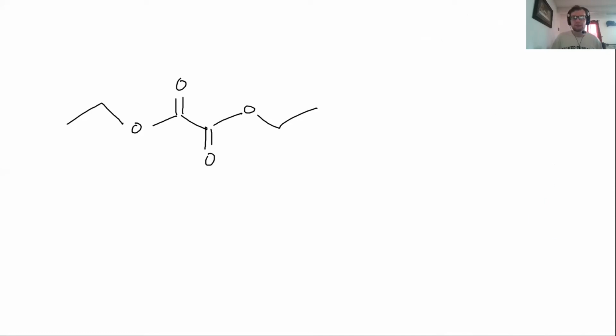So when it comes to fragmentation, I start looking at these carbonyl centers or anything that's kind of positively charged. So right here, you have this positive charge center and this positive charge center. Why is that? It's because of dipole moment. So we have this dipole right here. The electrons are going away from the carbon center based on a difference in electronegativity, right?